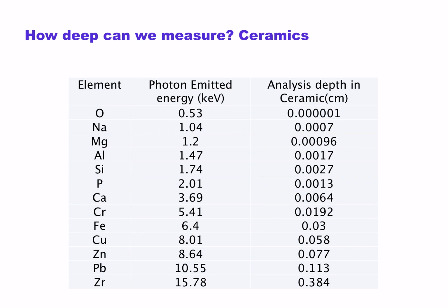If we look at it with numbers, we can see the different elements with their different energies of fluorescence and different depths of measurement. So look, for example, at oxygen. We don't see oxygen with X-ray fluorescence, but technically speaking, it is fluorescing as long as you're sending in the right energy. In this case, we're sending in about 0.53. We're getting 0.53 keV in fluorescence for oxygen.